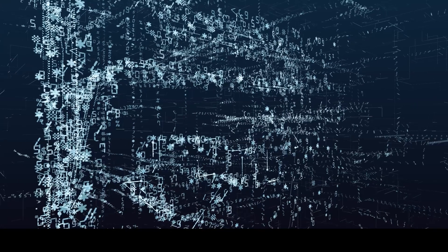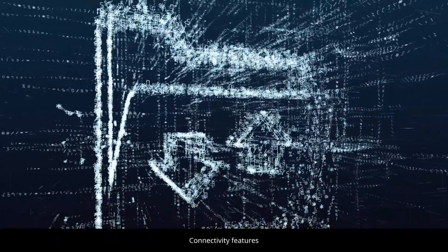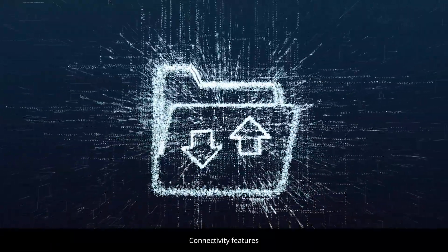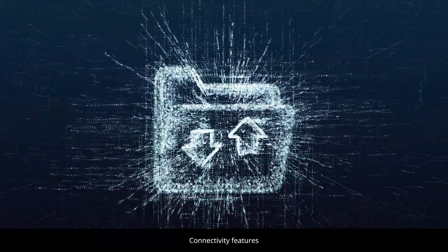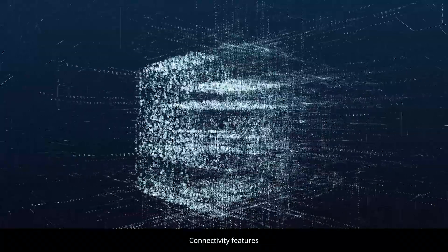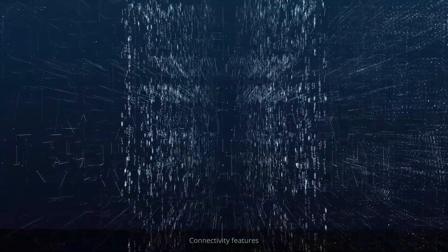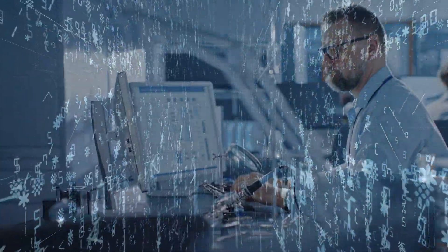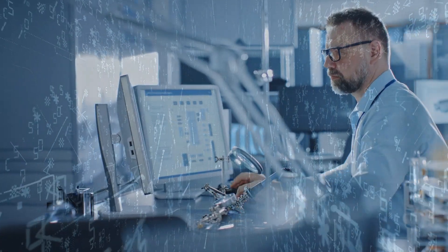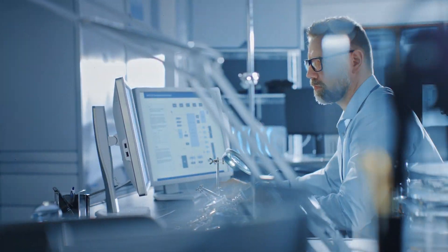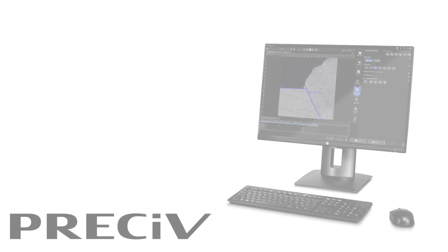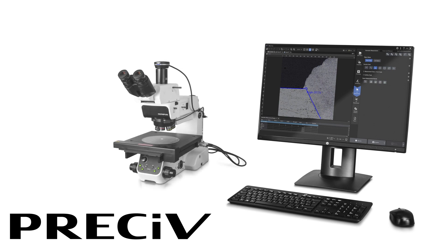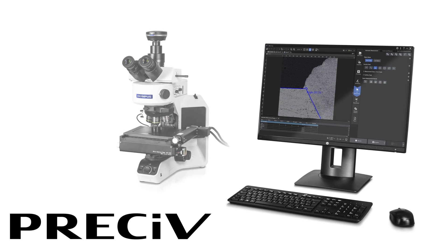And thanks to the software's connectivity features, you can save images, data, and reports to the cloud or a network drive to get the right information in front of the right person quickly and easily. Explore our next-generation PRECiV Industrial Imaging software for your everyday imaging tasks.